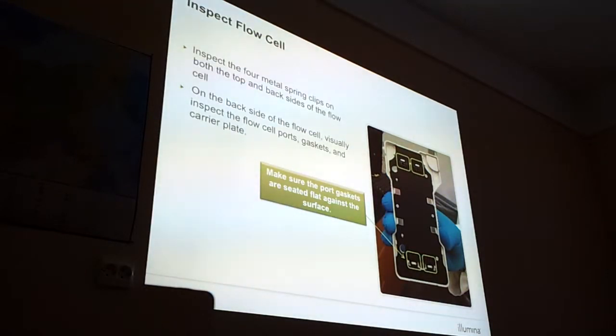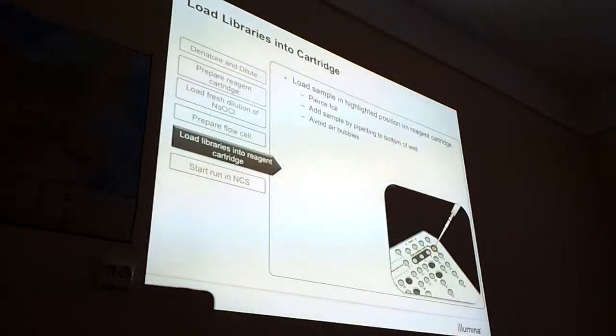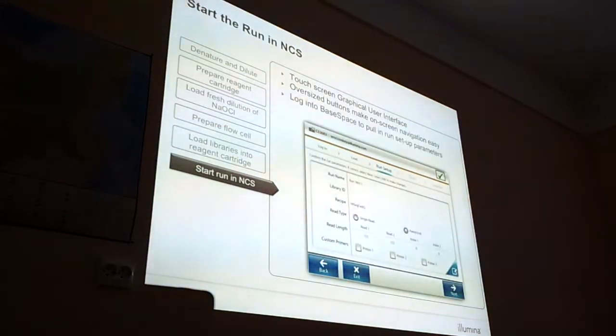So these gaskets. The ports should not be blocked, so nothing inside. I can give you this presentation. It's also in the manual. So, you load the sample, and then you start the run.